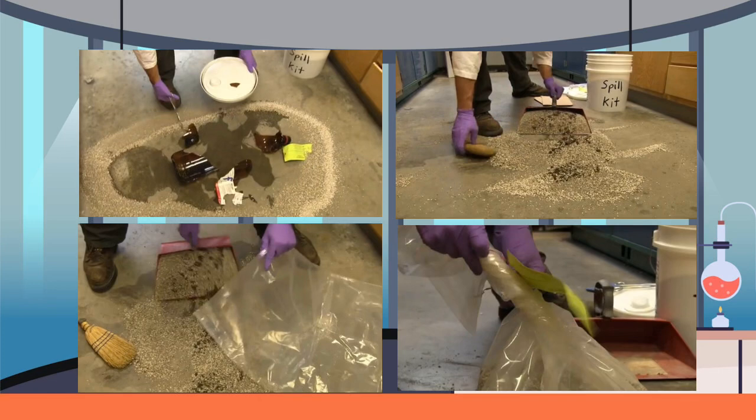After that, just give your lab supervisor a quick heads up that the spill happened. Finally, do your future self a favor and restock that spill kit right away. You'll feel much better knowing everything is ready to go if another accident happens.